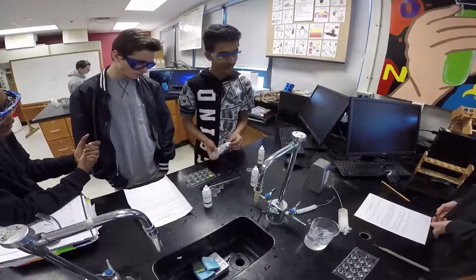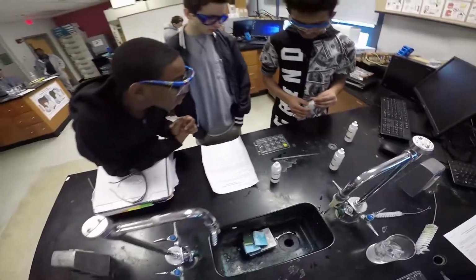Good reaction there. See that precipitate formation. Make sure you're following the directions.